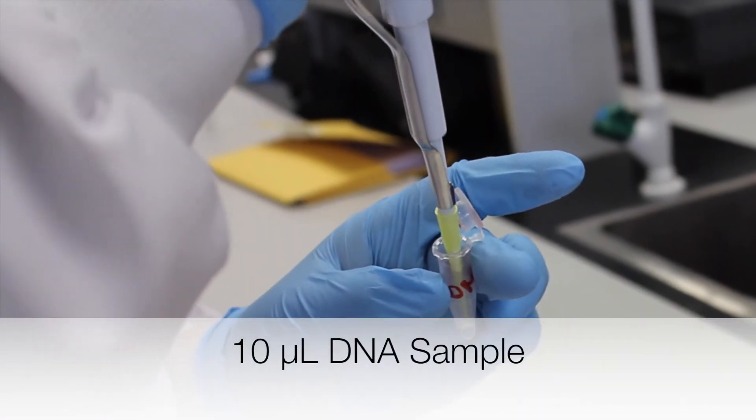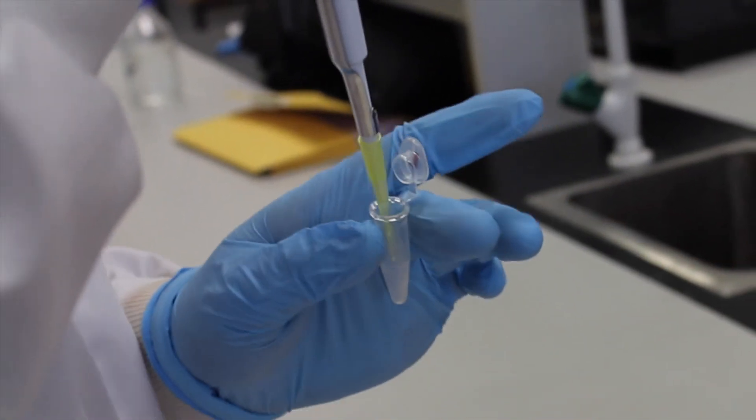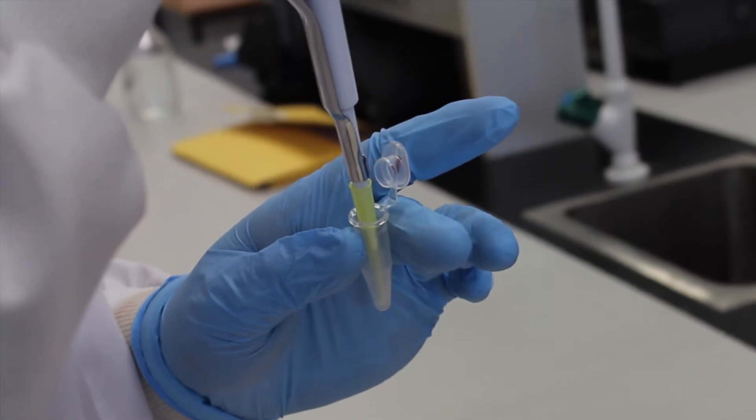10 microliters of a DNA sample is transferred into properly labeled Eppendorf tubes. This DNA has previously been mini-prepped. To view the tutorial on mini-prep, please click on the link provided.